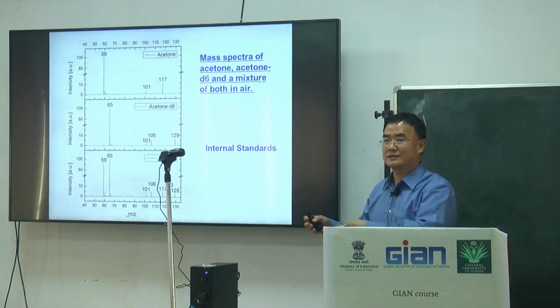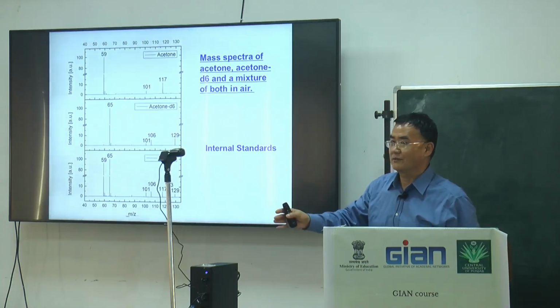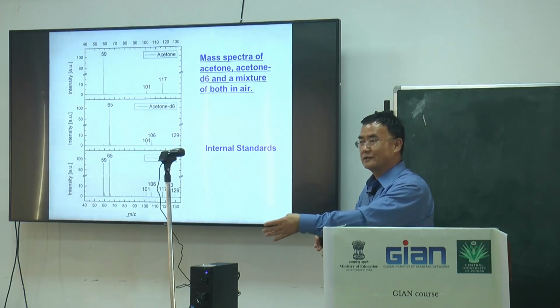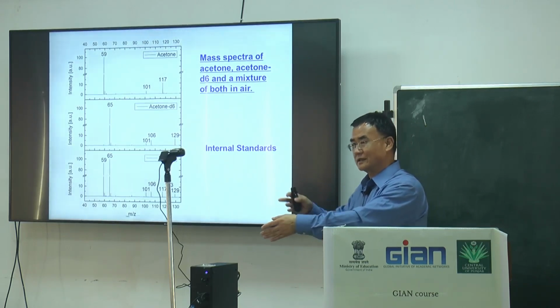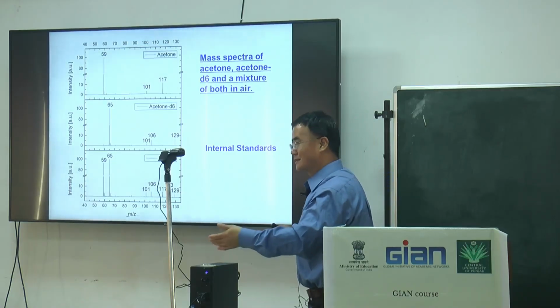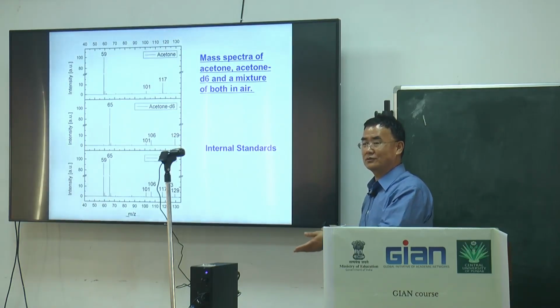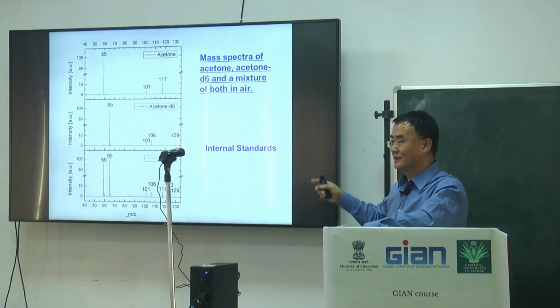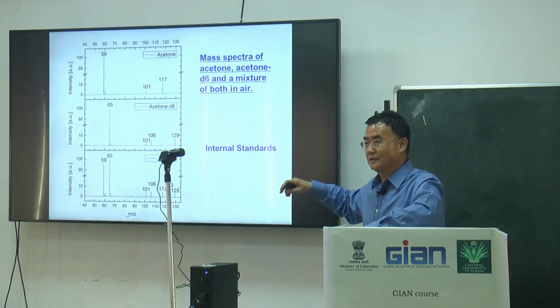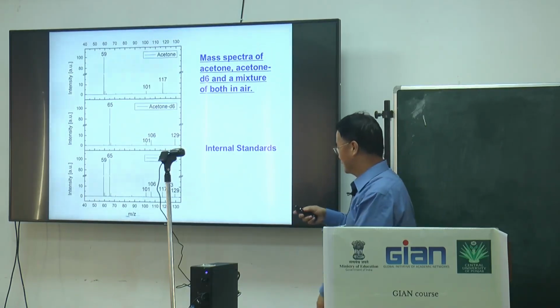So people can see you use this to identify the retention time, very closely matched to the natural jasmonate, compared with the carbon 13 stable isotope labeled jasmonate as standard. So we can make sure the Q-TOF MS established hormone analysis is reliable.